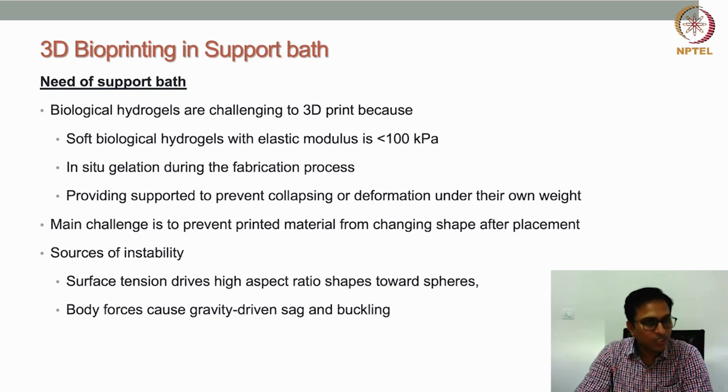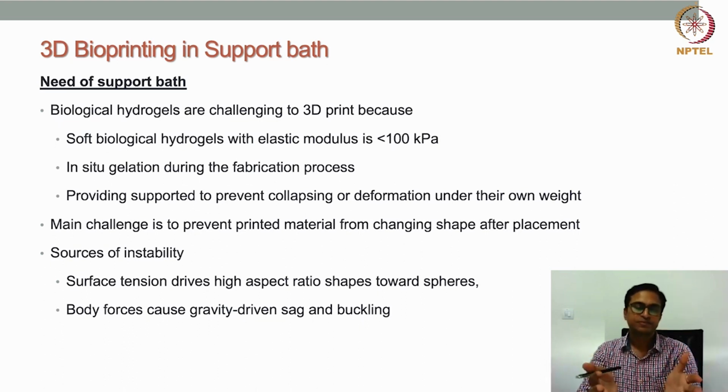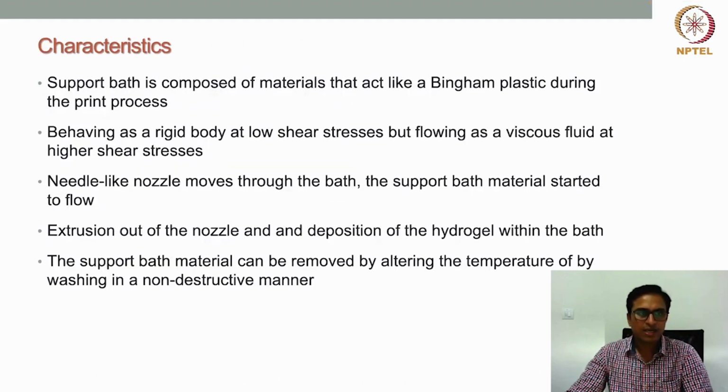So that's what we need: a support bath to provide support to the printed structures, specifically printed structures made of low viscous or low modulus soft hydrogels. These are a few characteristics of this support bath for 3D printing, that whole concept.